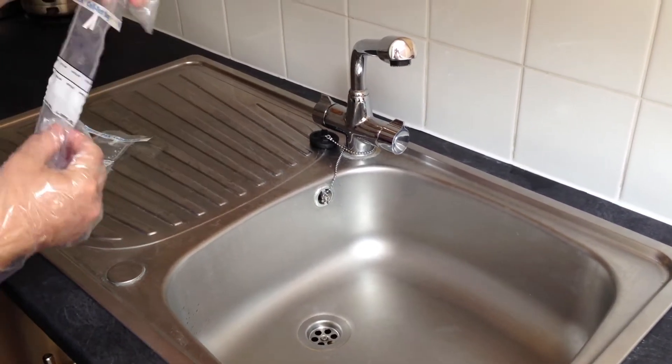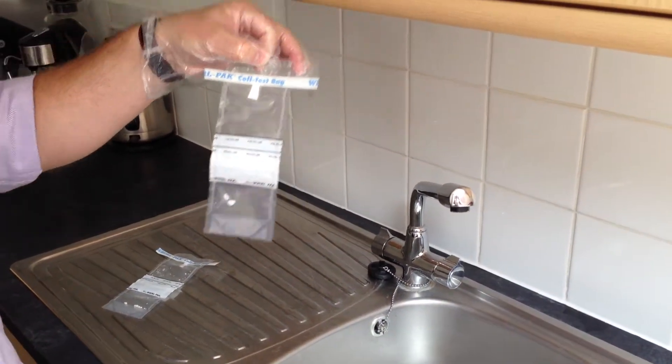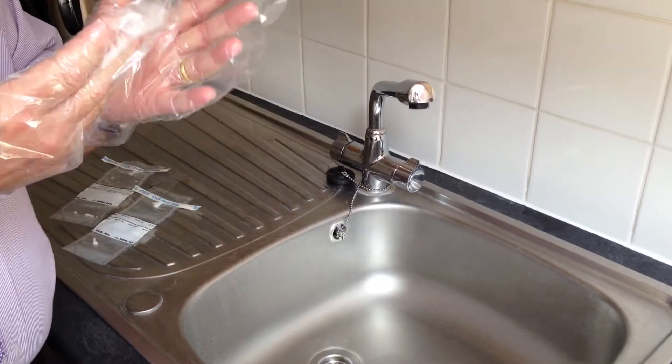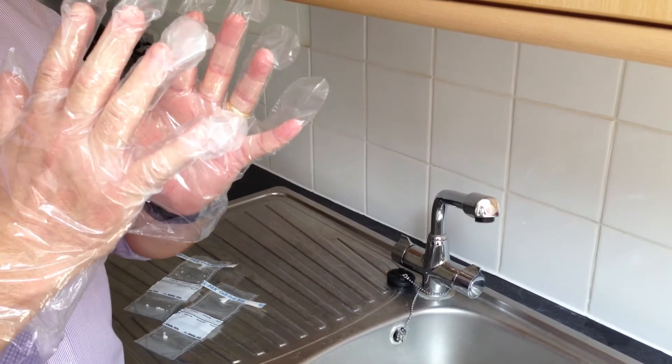We're now going to take a sample using these Coletest Thio sample bags. Before doing this, you need to ensure that you're wearing the appropriate gloves, so as not to contaminate the sample we're taking.